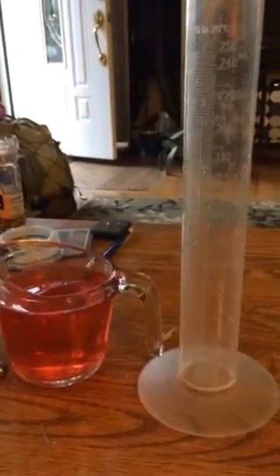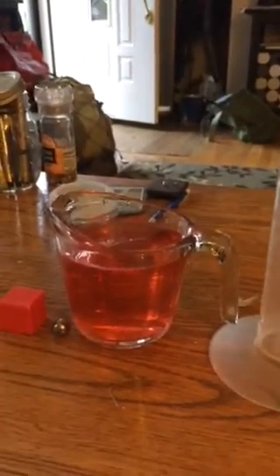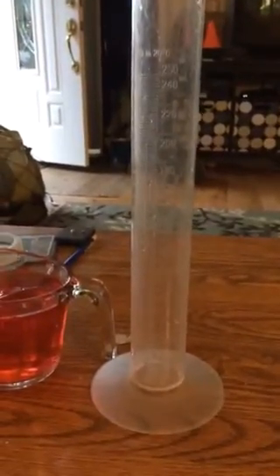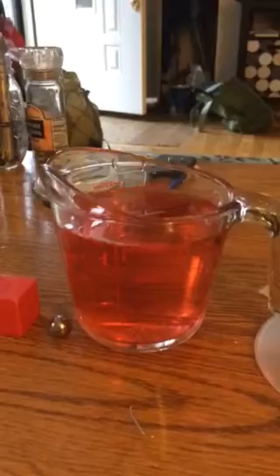First things first, safety. You will not need goggles in this lab because you will not be working with glass. Now I realize I have glass here, but you will not — yours will be plastic. The graduated cylinder is also plastic and all of your items are plastic. The red stuff inside the beaker is just water dyed red so that it is easier for you to see, so no real safety precautions — just make sure if you spill anything, you clean it up.